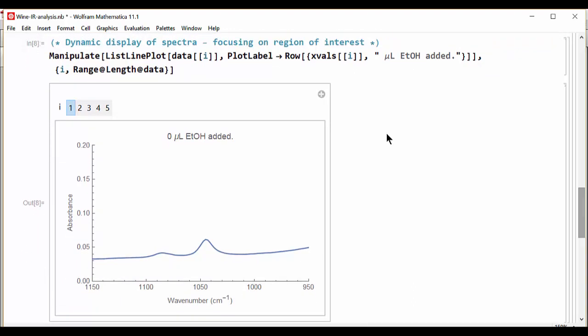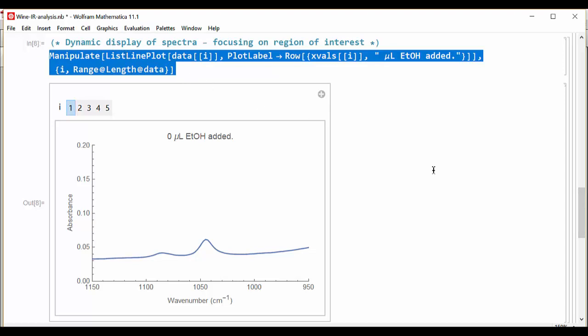And we'll start off with a dynamic plot using manipulate to visualize some of the data. So there are five spectra that were acquired, again starting with no ethanol added all the way up to 160 microliters.